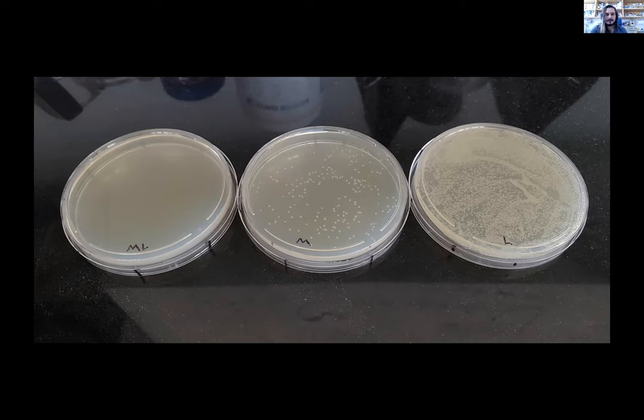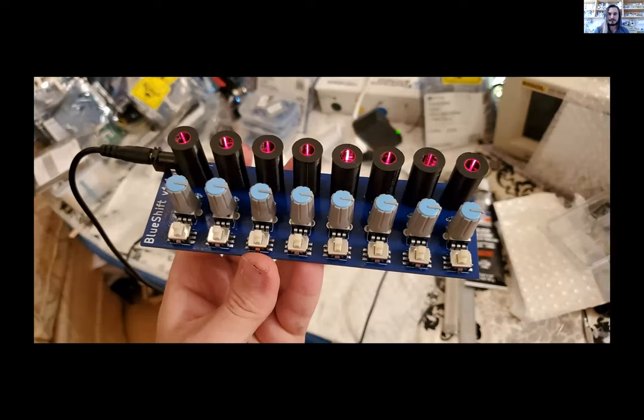So taking that hint, I kind of decided to design a little bit of a device. Super, super simple. A bunch of switches, knobs that just turn it from off to max power, and a bunch of holders. And that's an ongoing project. I won't get into the details, because like each one of these projects I can talk on and on about individually. I have a whole bunch of data for different ones, and I'm going to update that as soon as I can. But this was really simple.